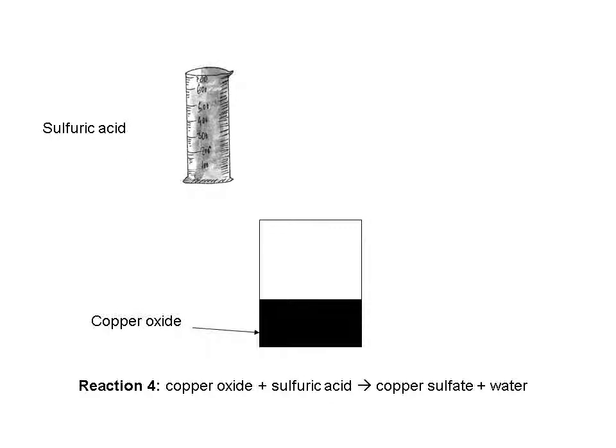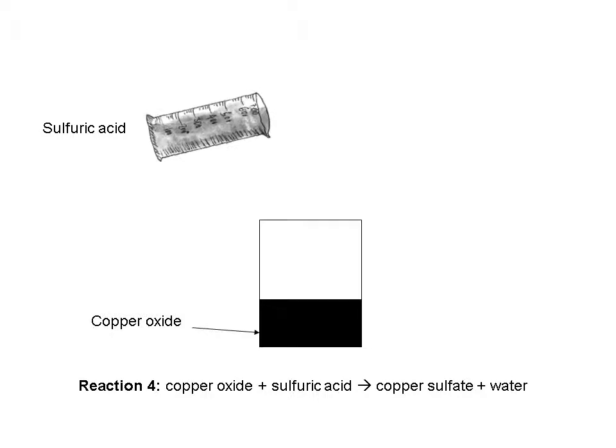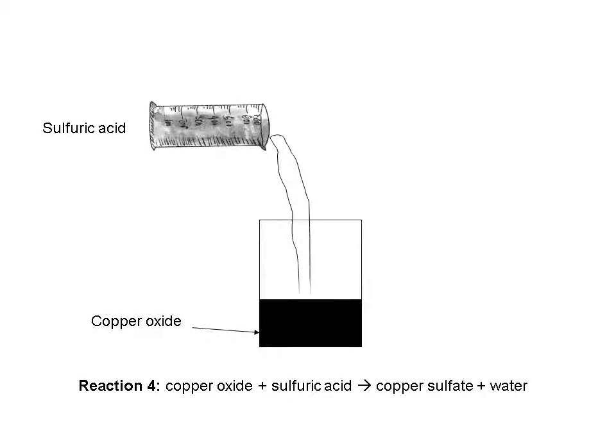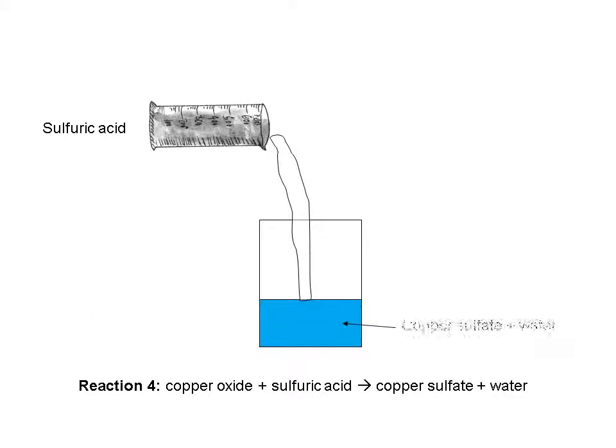Part 4 of the reaction involved turning that black copper oxide into copper sulfate, which is a pale blue color. And to do that, we had to add some sulfuric acid. As the sulfuric acid went in, and with lots of stirring, the solution finally went to that nice clear blue color. The other product of the reaction was water. And since we already had water in the solution, it's not really going to make any difference to the appearance.